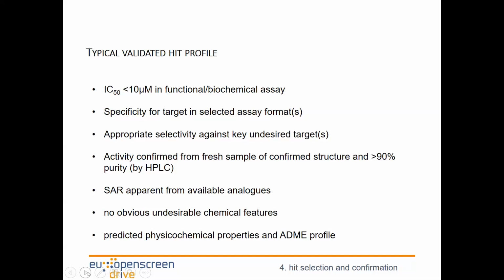Before we actually hand over our data package to our team members, we need to confirm that the activities are real, and this should be done from a fresh sample of compound, either purified from your stock, or you resynthesize, or you repurchase a fresh solid sample, and the compound activity should be retained.